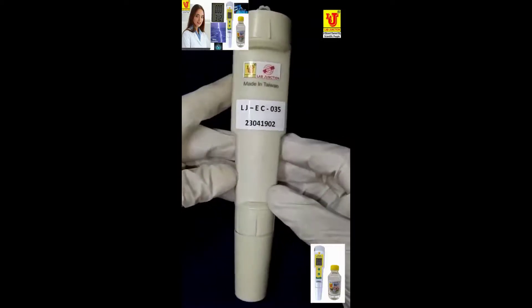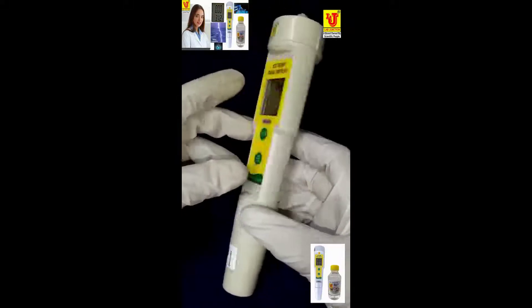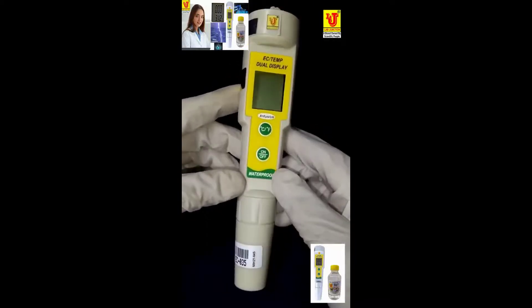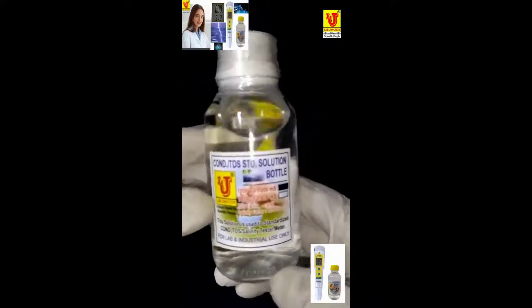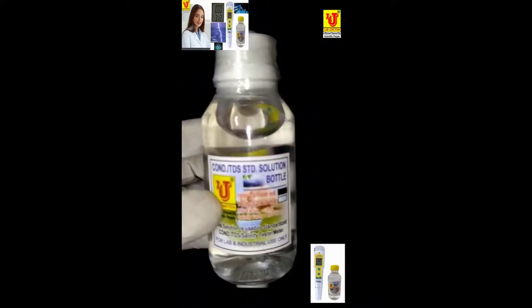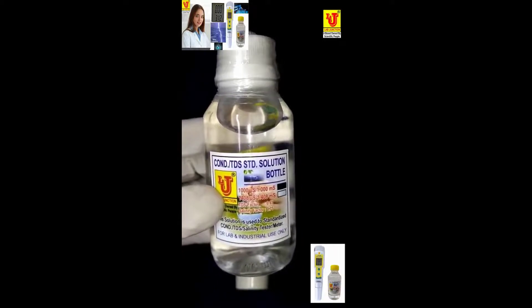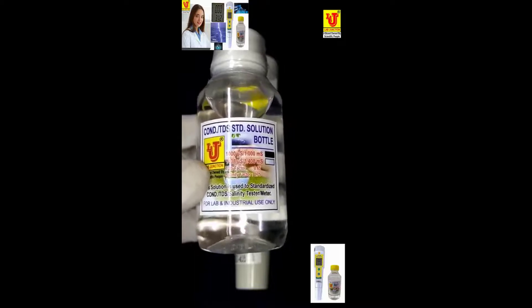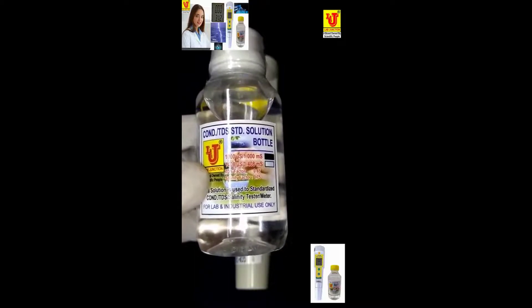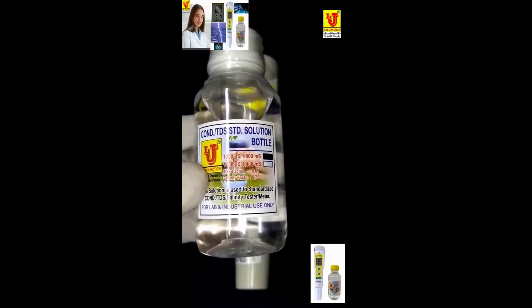With this instrument we supply a waterproof body. We supply a conductivity standard solution of 1000 microsiemens, or 1 milliSiemens conductivity solution.